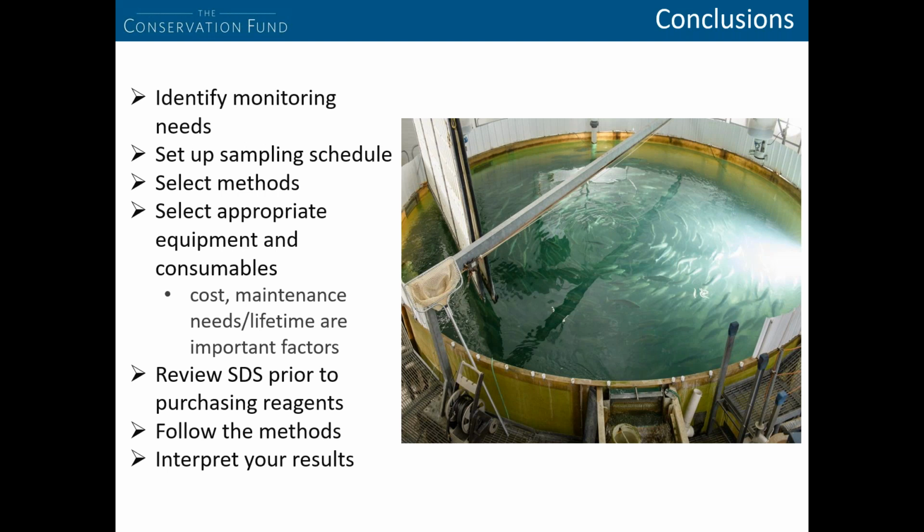And then before purchasing any reagents or consumables, you want to review all of the SDSs that are associated with those reagents and consumables to make sure that you have the proper safety procedures in place. And then lastly, you just follow your methods and interpret your data.